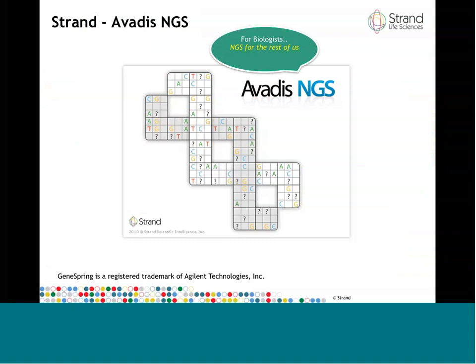The crux of Avadis NGS and what differentiates it from other products is what is reflected in the tagline, NGS for the rest of us. So Avadis NGS takes fairly large amounts of complex sequencing data and manages to bring all of that together in an interface that's very simple, easy to use for biologists, and is also very visually appealing.